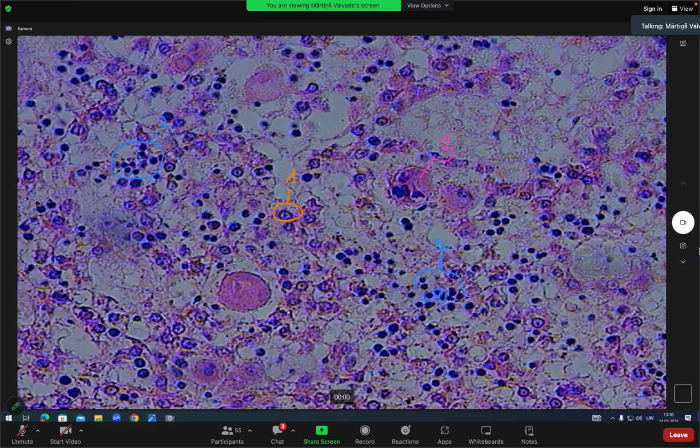These are the 3 cells that can be asked in the colloquium. I've seen megakaryocytes are not labeled, but basically they also are one of the blood stem cells. They produce platelets. These are very large cells with a multi-lobe nucleus, resembling an osteoclast a little bit, but that's a megakaryocyte. 3 cell types. Is this clear? You don't need to distinguish any blood vessels. There are no classic liver lobules yet, nothing like that. So that's the basic idea here when we talk about the liver. Is the idea clear?